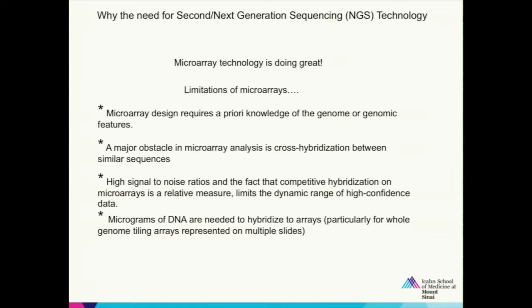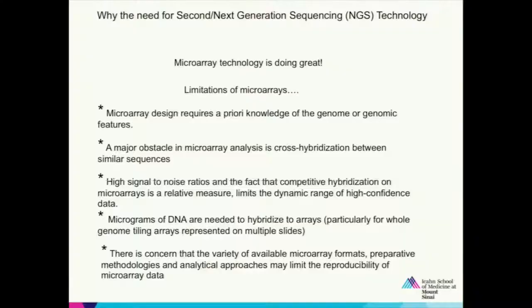It looks like less, but again, if you would like to use small amounts of DNA depending on the conditions, if you want to use a few cells from a brain biopsy or any biopsy, a few number of cells, needle biopsies you do. Or nowadays you are going for single cells, if you are doing differentiations, single cells, you can't use microarrays for that. It is too little an amount.